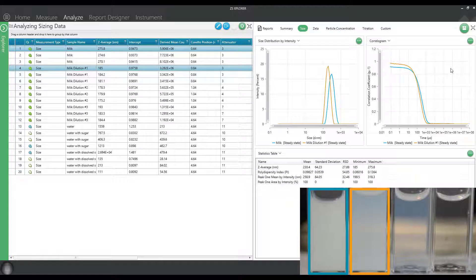That doesn't really make sense unless I was having some multiple scattering in the first run of the straight milk. And then by decreasing the concentration, I have now eliminated the multiple scattering. And now I have a much more accurate sizing result.